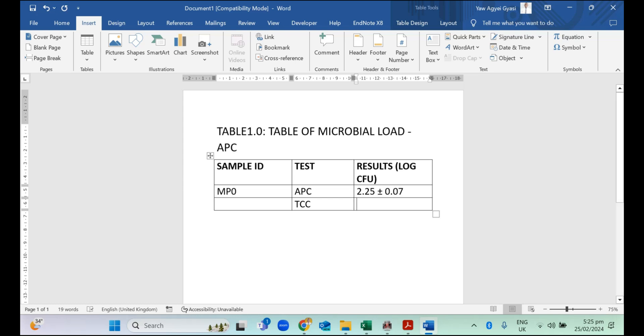If it was more than one sample you analyzed within the samples, you can also compare the results you have. Supposing we have MP yogurt, we have AP yogurt, you can compare MP to AP, and so on and so forth.